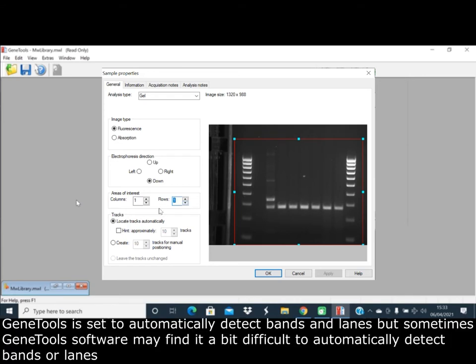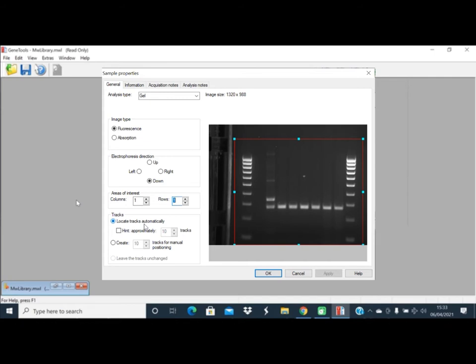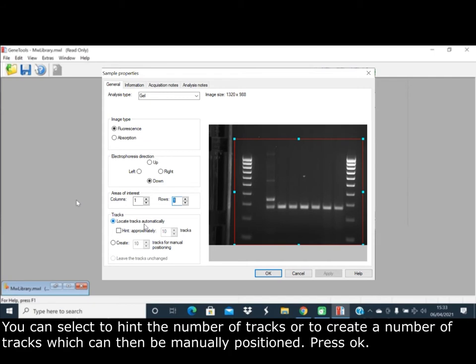GeneTools is set to automatically detect bands and lanes, but sometimes the software may find it difficult, especially when you only have a few lanes with any bands present or if there is a high background. You can select to hint the number of tracks or create the number of tracks, which can then be manually positioned, and press OK.